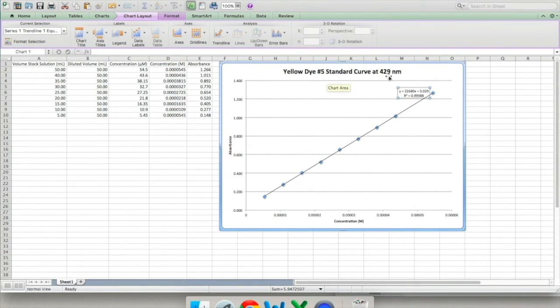Now, the trend line equation is the most important thing about these kind of curves. If you have measured one of the two variables, you can get an estimate for the value of the other variable using this equation. Now, notice how our line has a y-intercept.